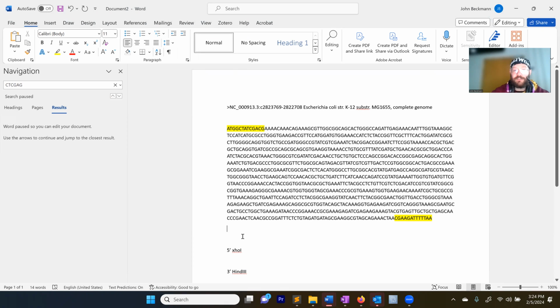So a good heuristic for setting primers for any PCR is that your annealing temperature should be somewhere between 56 and 60 degrees Celsius. That is a normal temperature that's going to work, okay? So I'm just going to extend out until I hit a temperature within that range. The other rule that you want to follow is what's called the CG clamp rule.